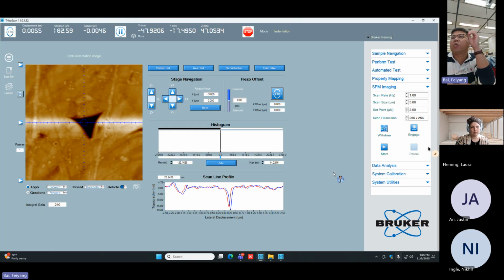Well, it's powder but glued in some material, like a sheet. Okay, so it's more like a composite material than a powder on a sample. It looks like paper literally, and on the paper there's some carbon powder on top of it, and all the black is carbon.